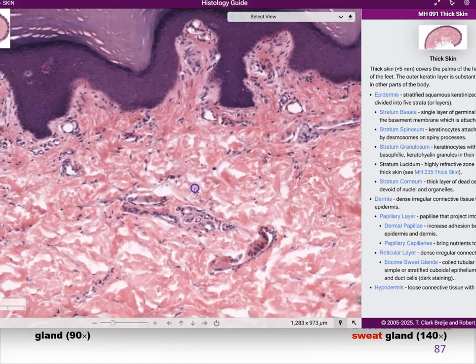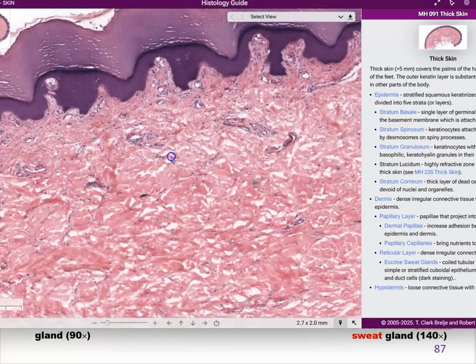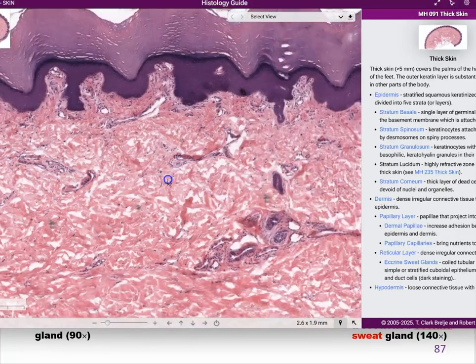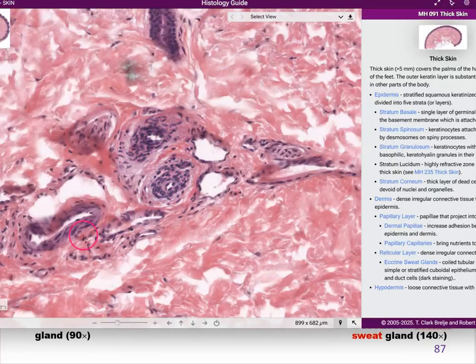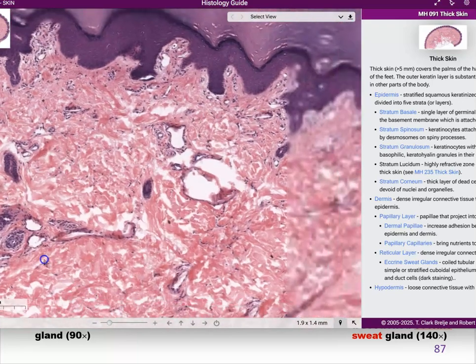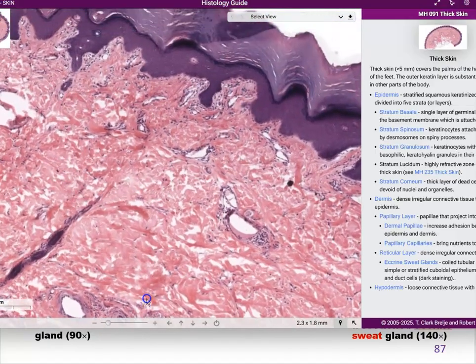This is our original thick skin. We're not going to find a hair follicle. Will we find a sweat gland? I mean, will we? Yes, this is a sweat gland. So you're just seeing random parts of a highly coiled structure made of epithelial tissue when everything else around it is just collagen. There's so much to look at in skin.